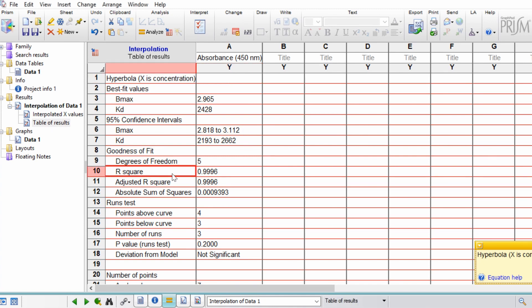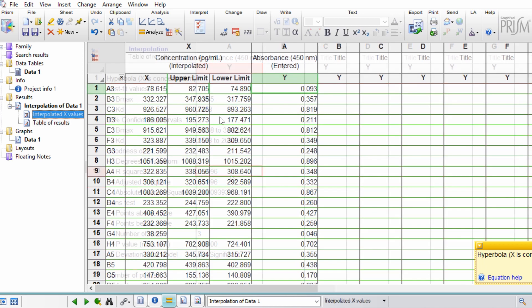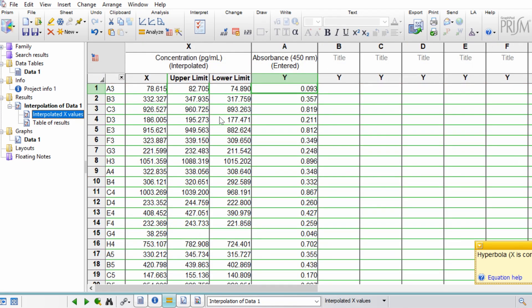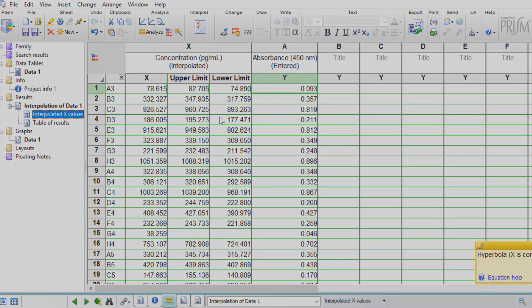So that is how you can use GraphPad to interpolate a standard curve to calculate the concentrations from known absorbance values.